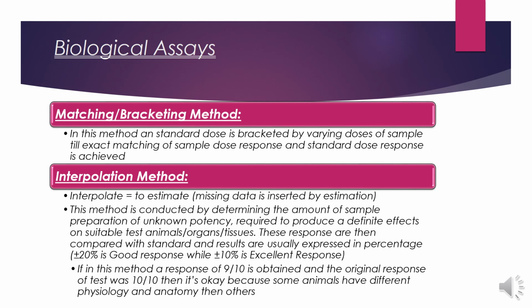So basically here we have an estimation based upon percentages: how many of the animals have shown a response when the sample or standard doses are given, and then they are compared.